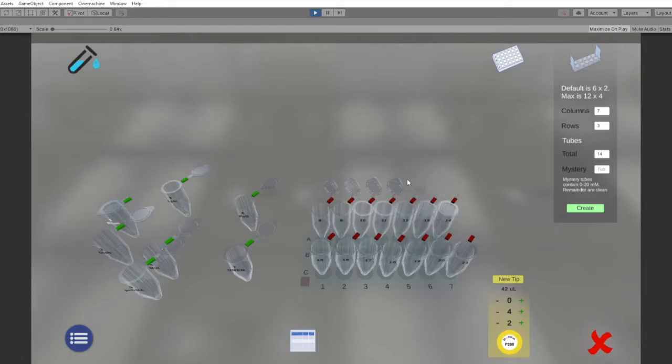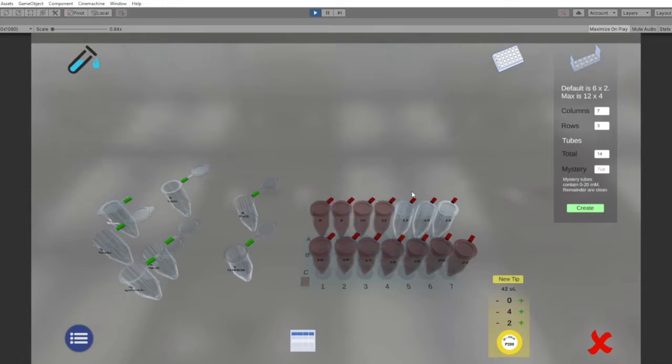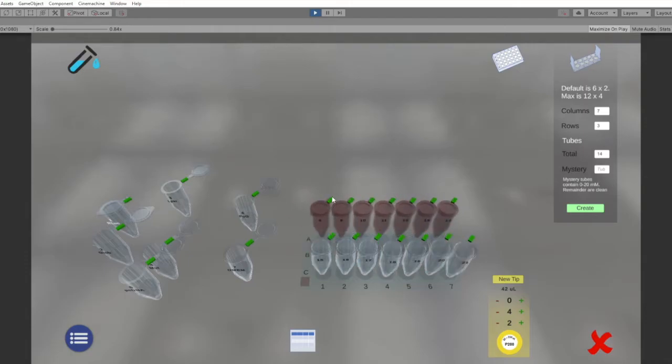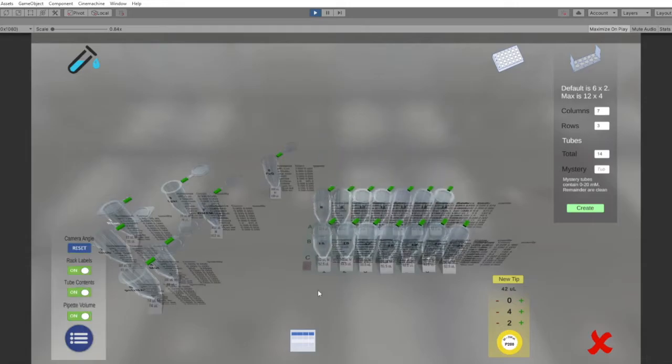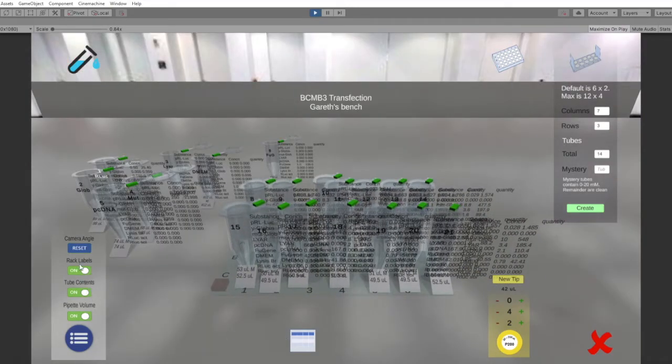And now what we're going to do is select them all, and then we're going to press the M key to mix them all. So that's a crucial little sequence. Pressing M, they all shake, deselect them, they're all nicely mixed. So that will be the end of day 1 of the prac, getting those solutions. We can check the contents of them at any stage by clicking on the details button and having a look to see what's in them.